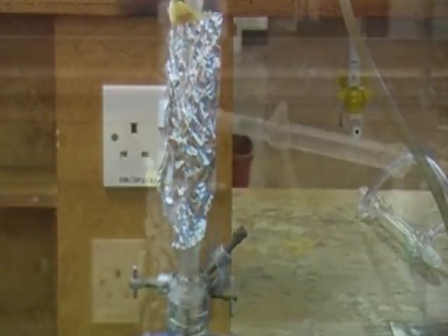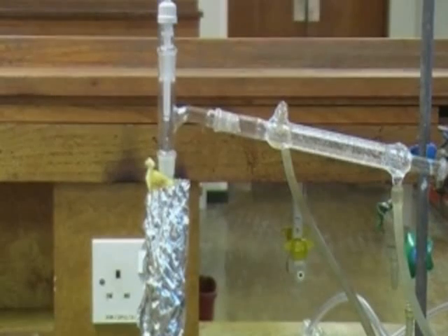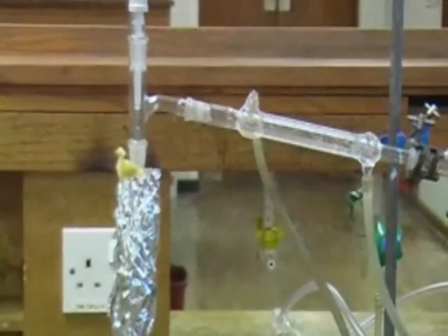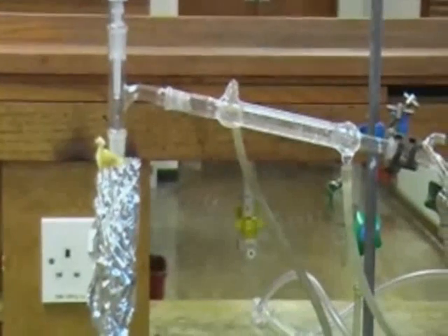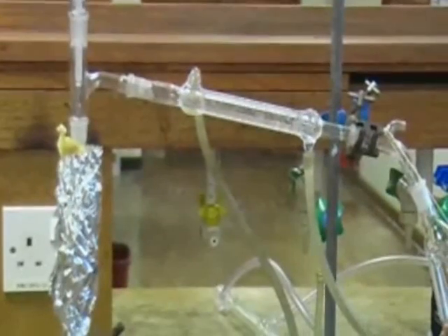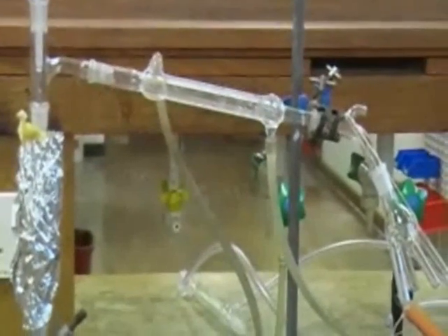Above the fractionating column we have a standard still head, and into this we've placed a thermometer which will allow us to measure the boiling points of the different liquids, or fractions as we call them. A condenser is connected with water flowing steadily from bottom to top, and this is followed by a receiver.